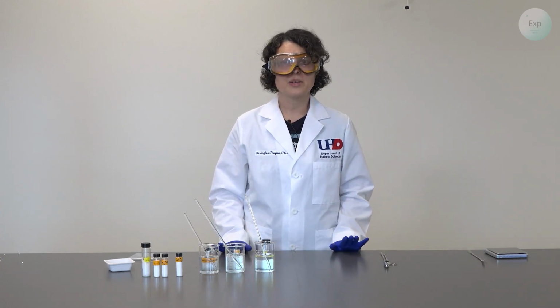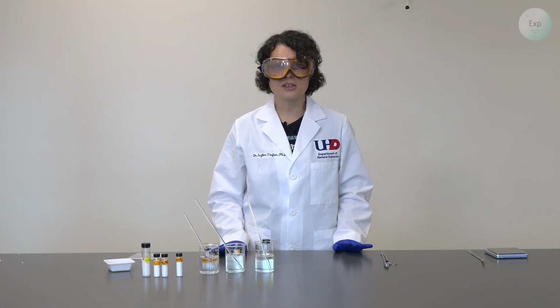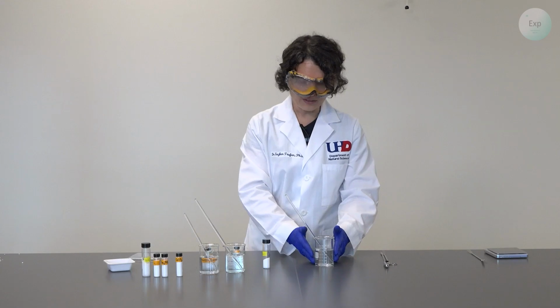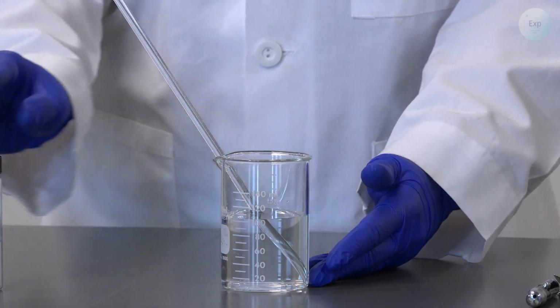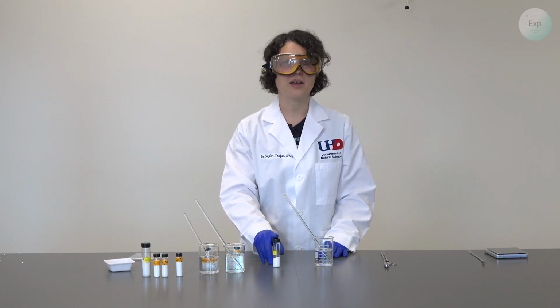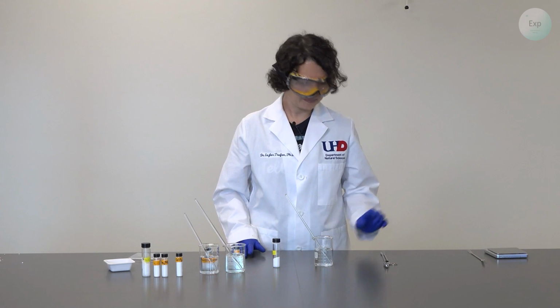There are a couple ways in which we can ascertain solubility. The first is the production of a solution. A solution is going to be a clear liquid. So in this case, when we look at our water, on the bottom, we can no longer see any sodium chloride particles. And that means that all of it has dissolved. For sodium chloride, that means when it fully dissolved, it also separated into sodium ions and chloride ions that are surrounded by water molecules. So we should no longer have anything that we would call sodium chloride.